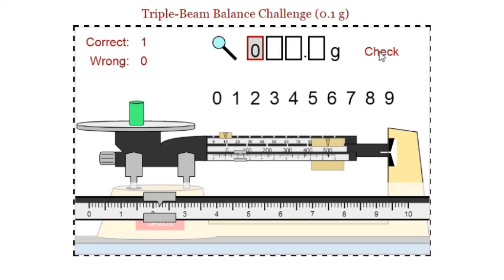Let's do another one just for fun. Again, look at your three riders: the one in the middle, the largest one, is at 500. This one in the back is at 10. Notice my magnifying glass has zoomed in on my front rider - it's somewhere between two and three.